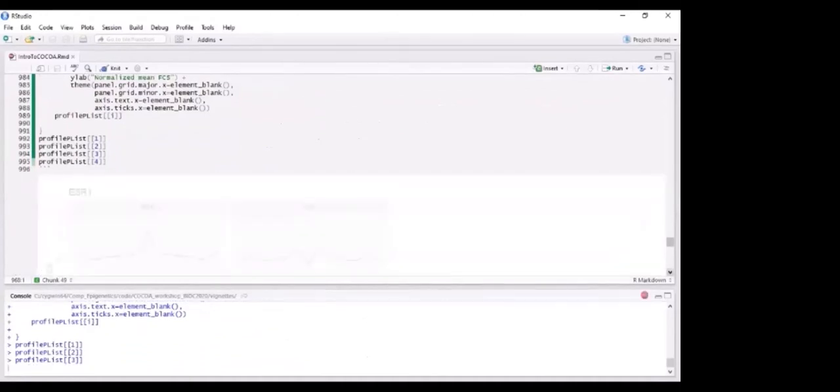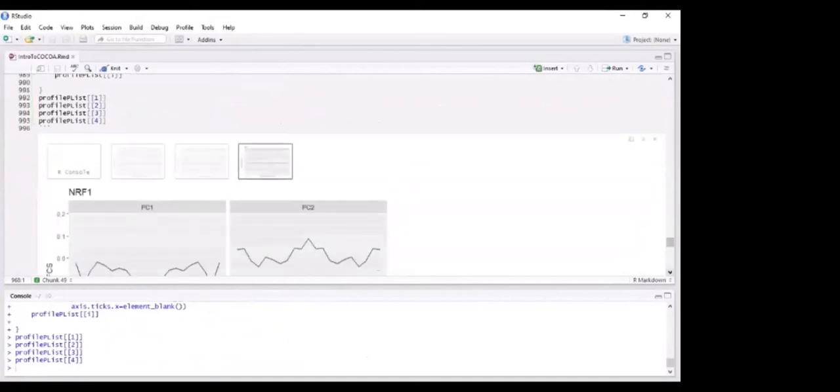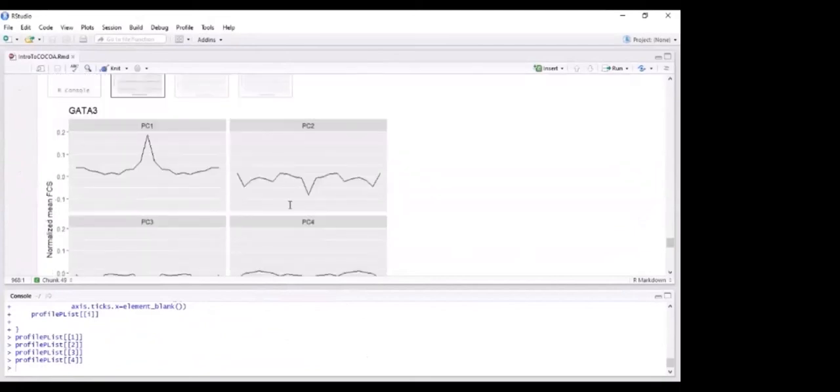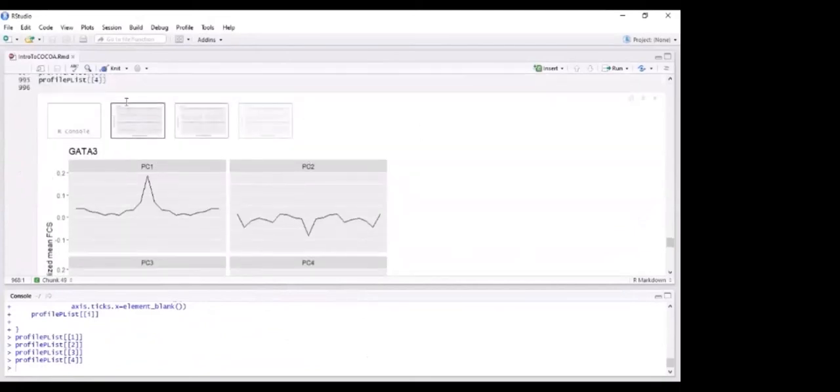And basically you'll see something similar to what we saw with DNA methylation data, specifically centered on the sites of interest. So here, GATA3, but we can also look at estrogen receptor, etc. We would see something similar for estrogen receptor.